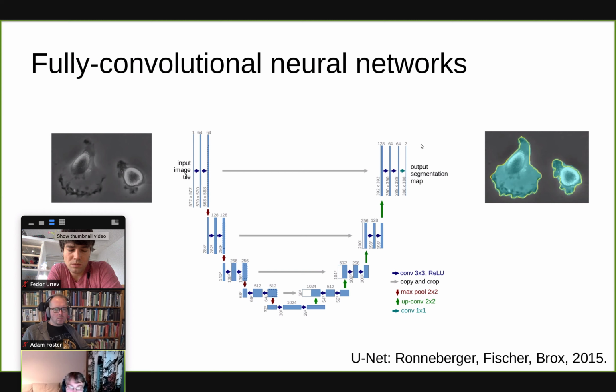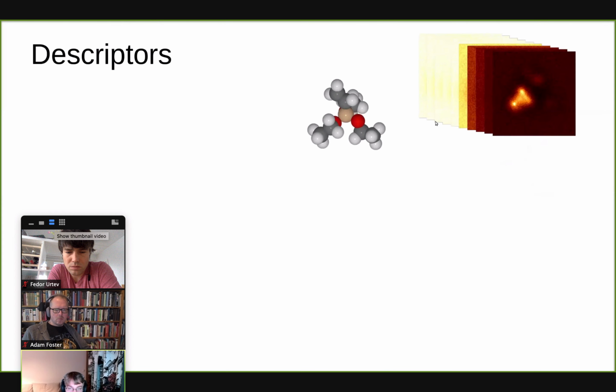And this is often used in tasks, for example, like image segmentation tasks, where you want to divide your input image into some kind of regions where there's something important that you want to look at. Okay, so then going back to our specific case of application, the Atomic Force Microscopy images.